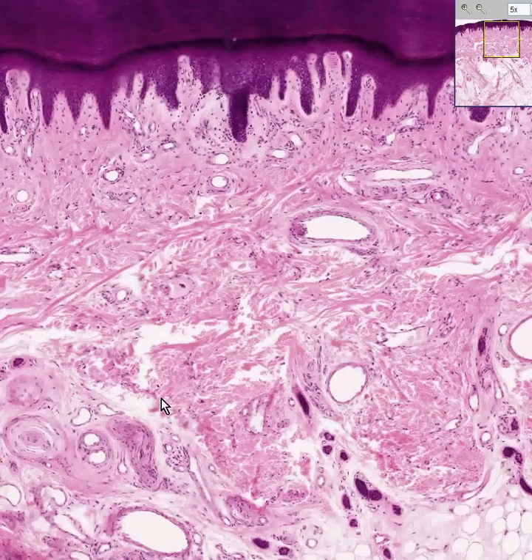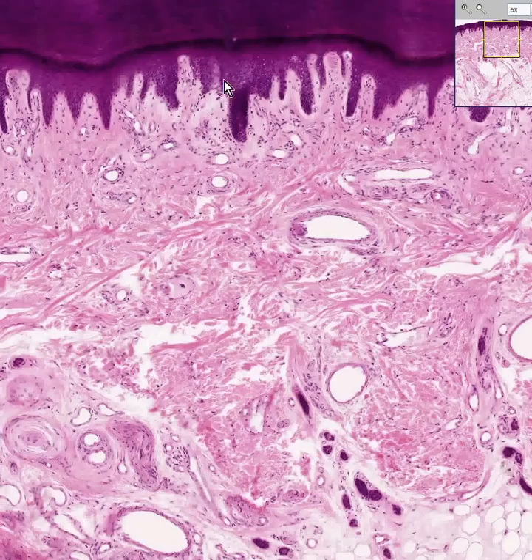The reticular dermis is rich in elastic fibers, but you can't see those because we don't have an elastic stain. However, if we did an elastic stain, you would see an extreme wealth of elastic fibers in the denser reticular dermis and practically none in the papillary dermis.